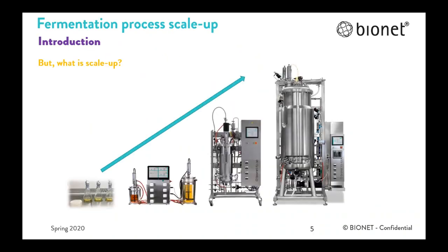But what is scale-up? Process scale-up, in a broad sense, is a critical activity that enables a fermentation process achieved in research and development to operate at a commercially viable scale for manufacturing. A successful scale-up involves many aspects of successful preparation and planning beyond pure process scale-up technology. Simple concept in theory, but sometimes complex in practice. Scale-up means the art of designing large-scale apparatus or a full-size plant using the data obtained from lab studies.